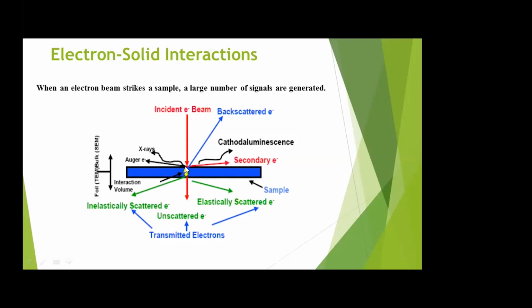We call this a teardrop sample. We can see the shape is like a drop of tear. Here the electron beam, a beam containing electrons which are thrown out from an electron gun, falls on this specimen.